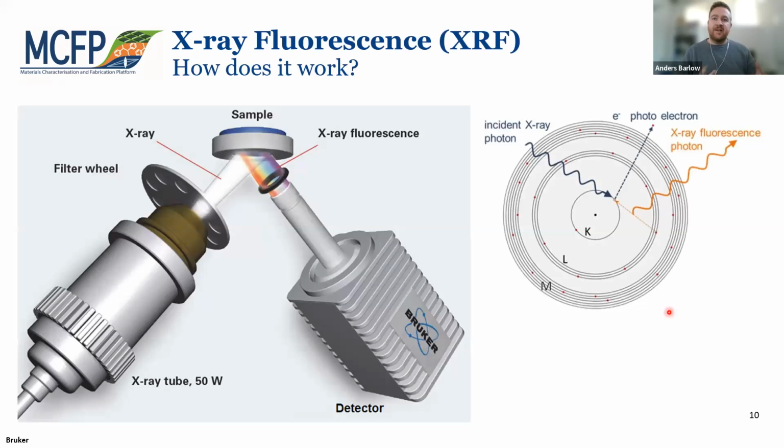Okay, so let's talk about the two different techniques separately now. We'll start off with XRF because it's the slightly simpler technique to start off with, and then we'll follow on with the XRD after that. So XRF, how does it work? It's relatively straightforward in a sense.